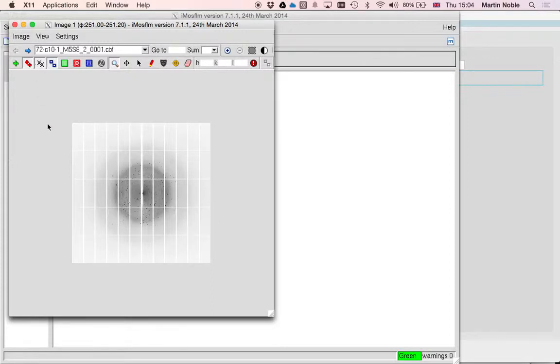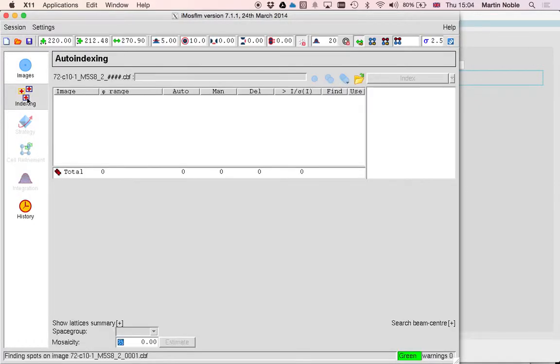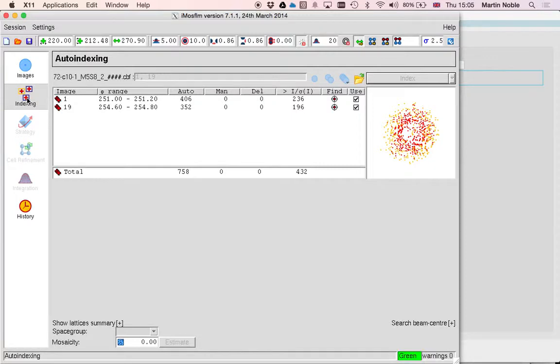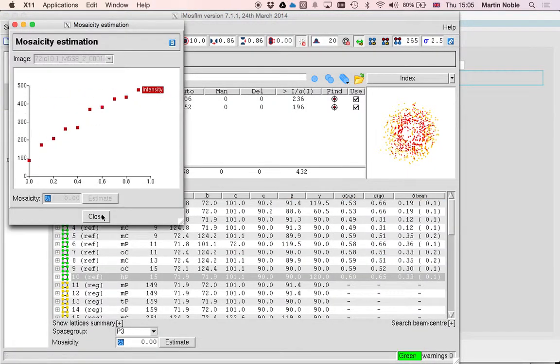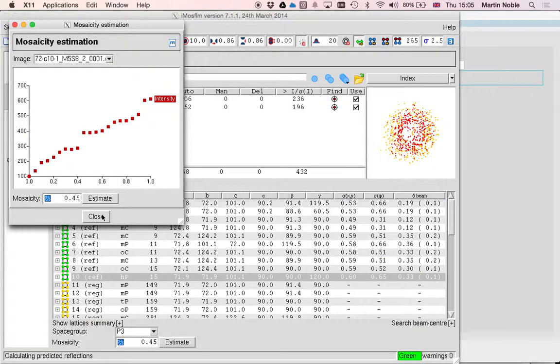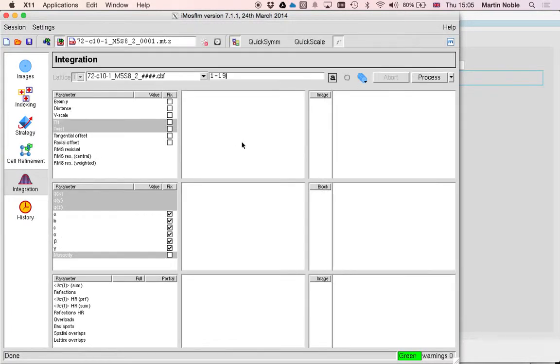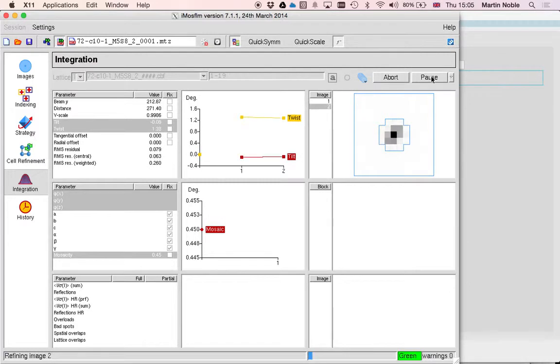If I was processing this carefully now I'd do things with the beam stop and that sort of thing, but instead I'm just going to dash through this. Ask it to do some autoindexing. It will automatically determine the mosaicity. And rather than refine the cell I'm just going to dive straight into an integration.